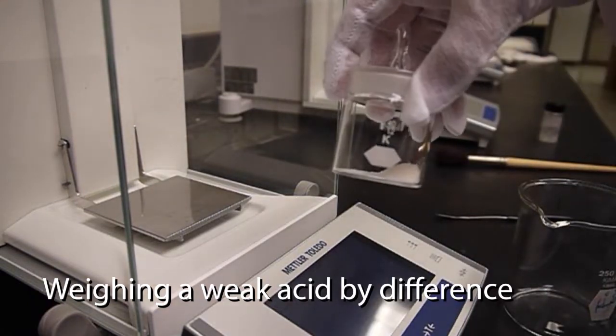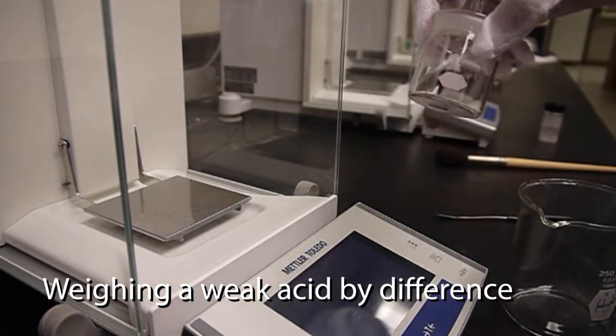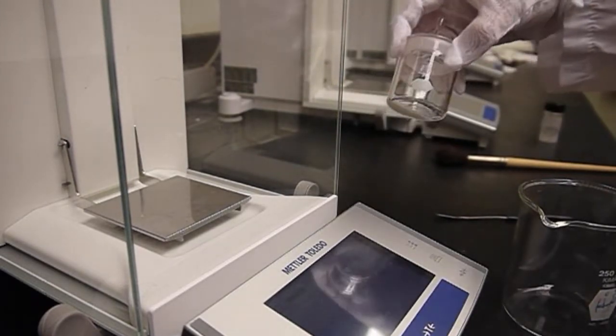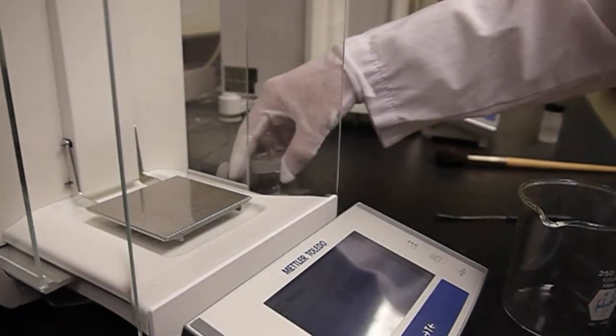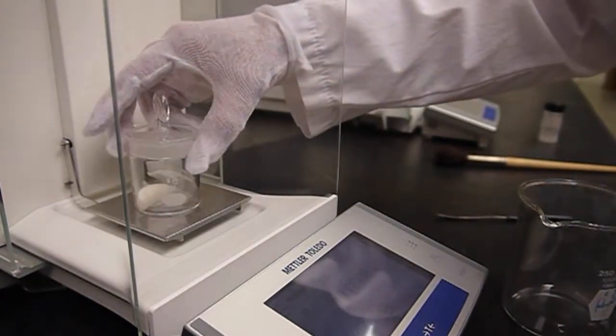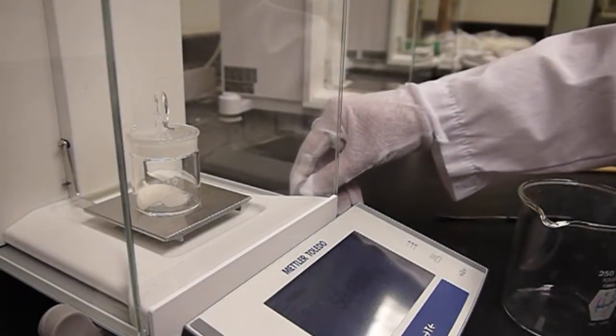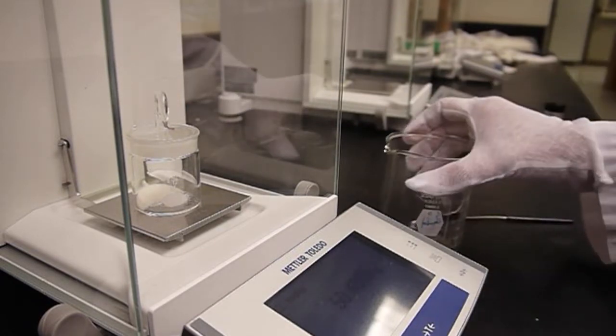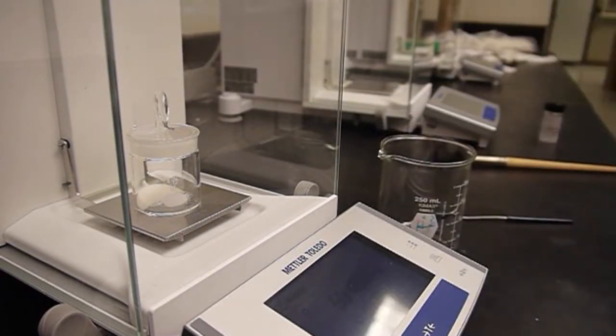I've taken my dried weak acid out of the oven. It's cooled in the desiccator. This is tartaric acid. Now I'm going to weigh by difference and try to get around 0.1 grams of tartaric acid into my beaker, which is where I'm going to perform the titration.